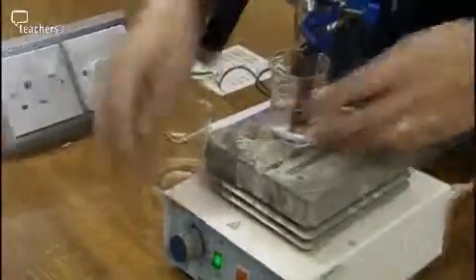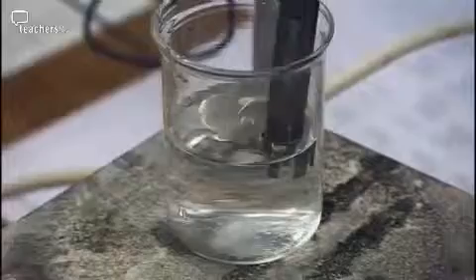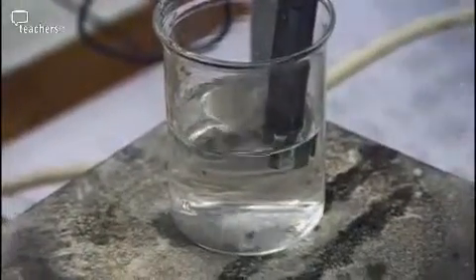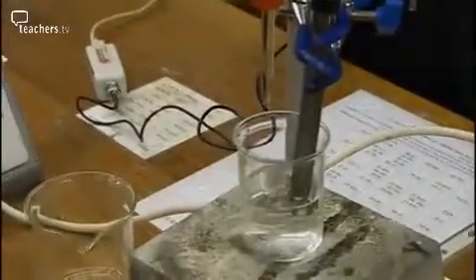I'm going to pop it in. So this is a little magnetic stirrer. Place it inside. So, the pH sensor is inside the acid. The stirrer is stirring things up nicely. We're going to allow the alkali to drop in by just turning this tap here, and it will drop at a regular rate. And then we're going to get the computer to actually plot the pH as time goes along.